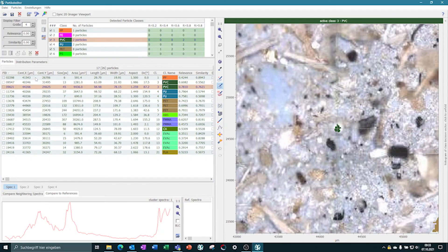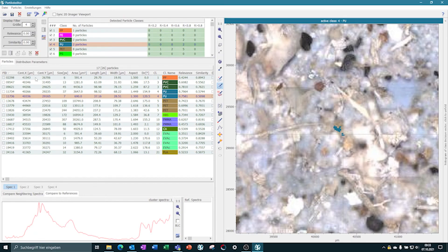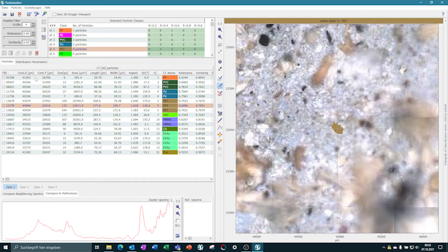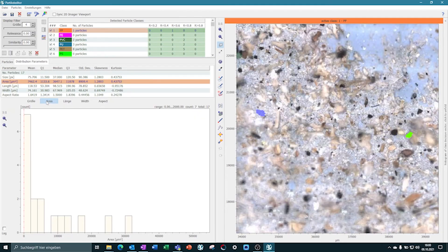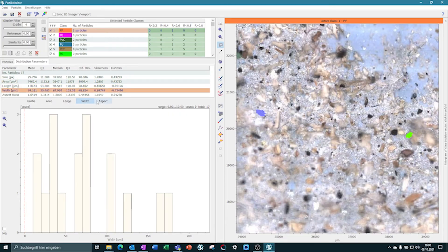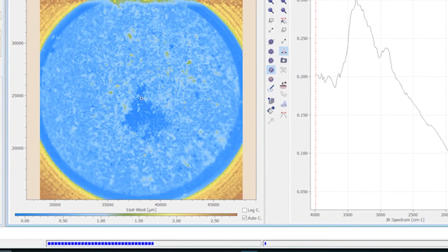Purency developed a powerful machine learning algorithm that was trained with huge amount of microplastic data measured by the Lumos II and analyzed by experts. It not only distinguishes microplastic from frequent environmental contaminations like cellulose or proteins, it also gives the users a comprehensive set of smart evaluation and statistical tools.